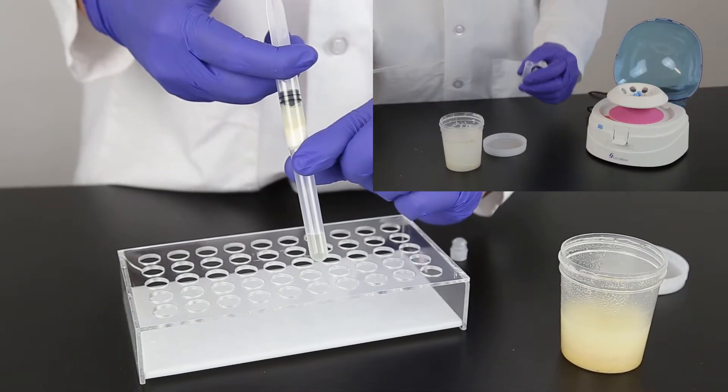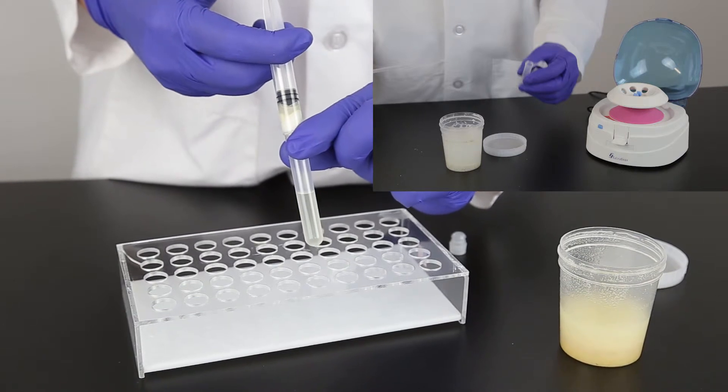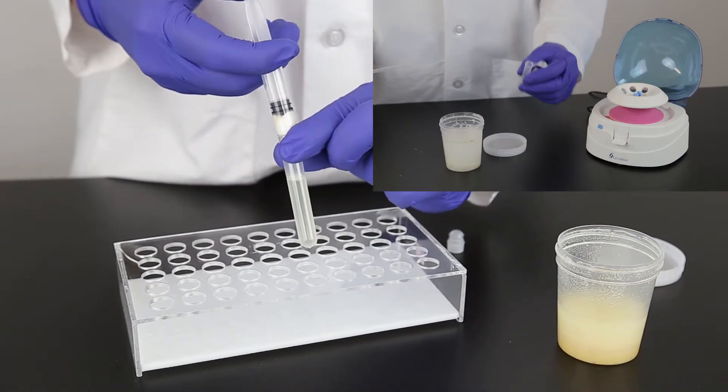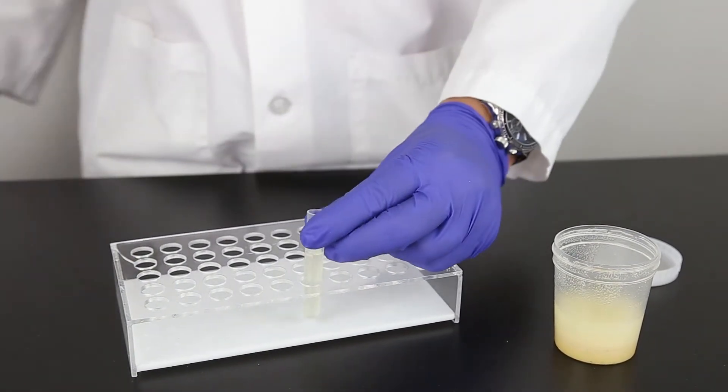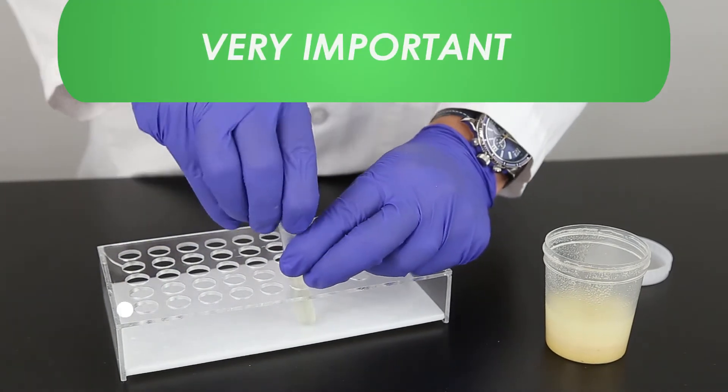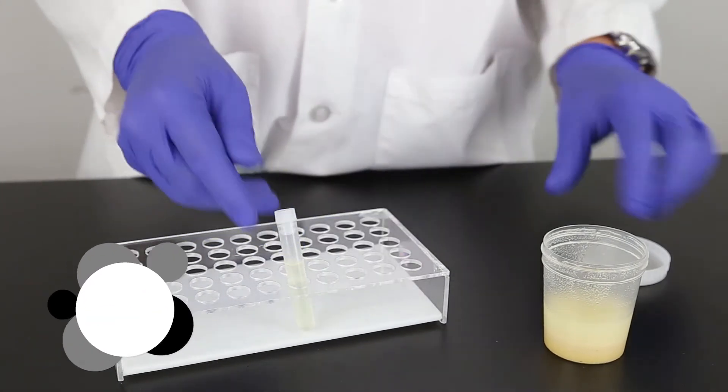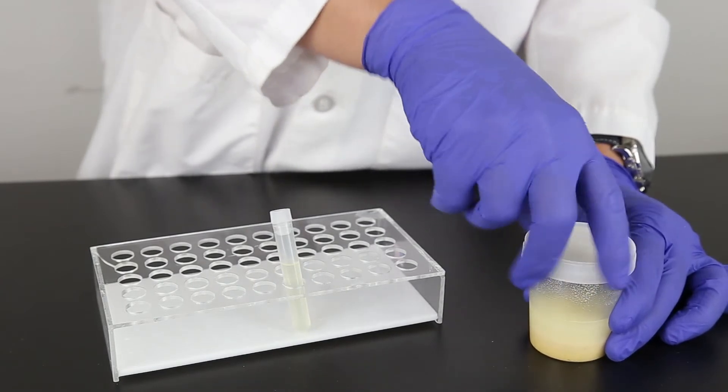You can also pipet the sample into a two milliliter microcentrifuge tube and centrifuge for 30 seconds. It is important to collect at least three milliliters of filtrate through a single filter syringe for optimal sample accuracy.